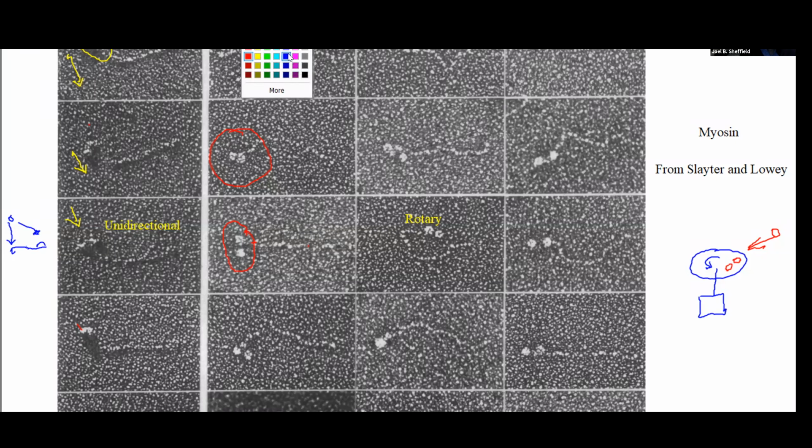I go back to a little ball on the surface. And I start applying shadowing material to one side from a low angle. Remember, we're talking about a low angle. And then I rotate, and this object now starts to build up shadow on this side.